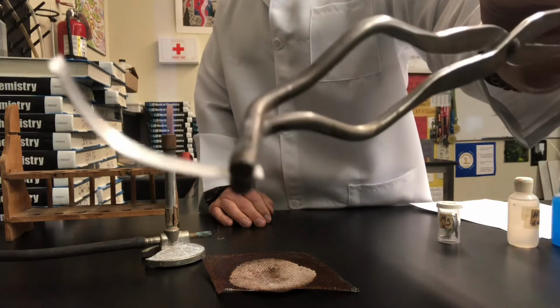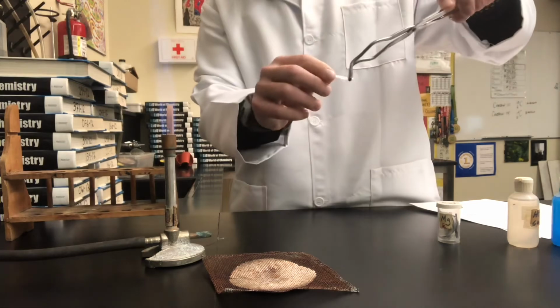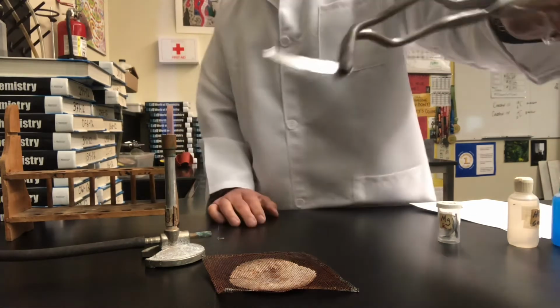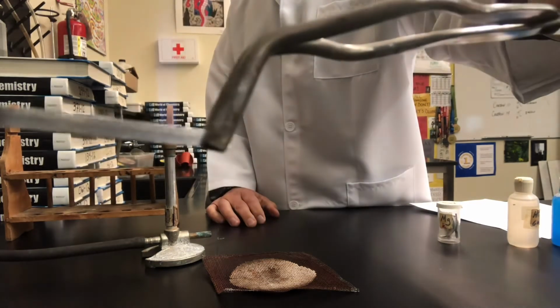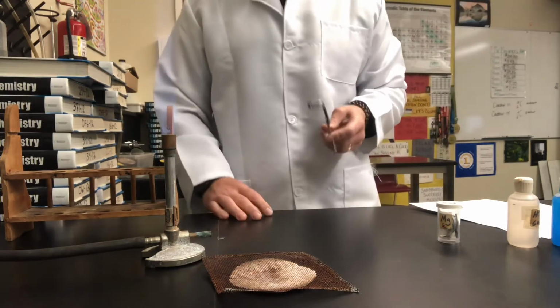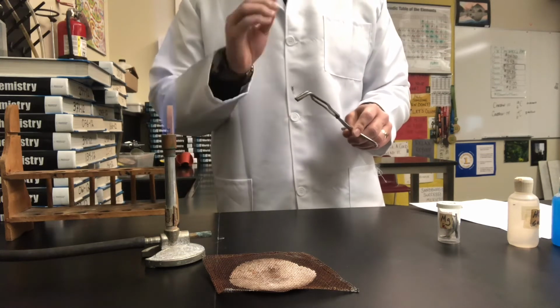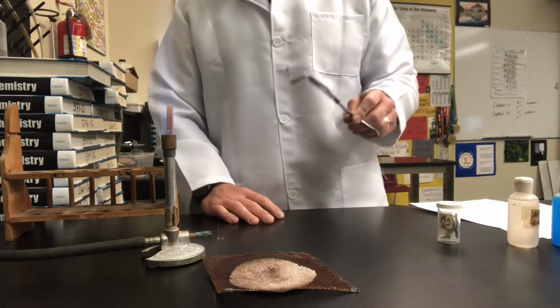If you look, this is magnesium, a shiny metal. It's malleable, bendable, and has a silverish color to it. That is the observation you should write before the reaction. Now let's actually create the reaction, make your observations, and then also document that in your data table.